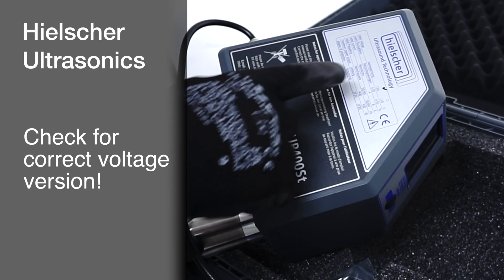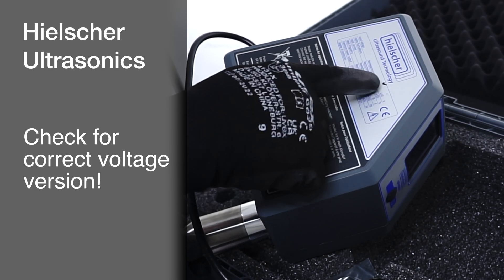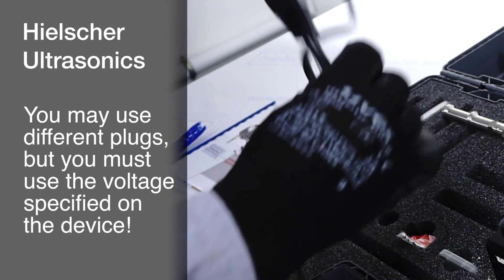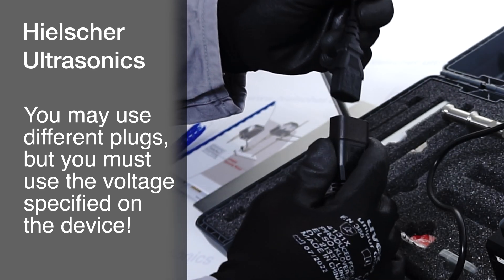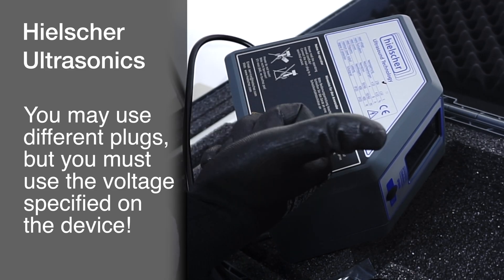The UP400ST ultrasonic device is available in two voltage variants: 110 volts and 230 volts. We supply the device with a plug suitable for your region. You may replace the power cable with one that has a different plug; however, you must ensure that the mains voltage matches the voltage specified on your UP400ST Sonicator.